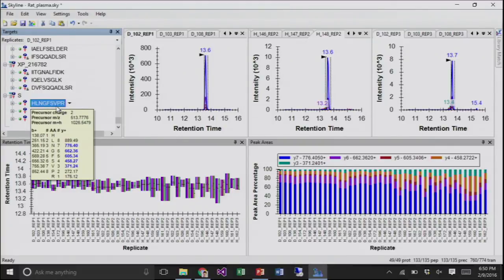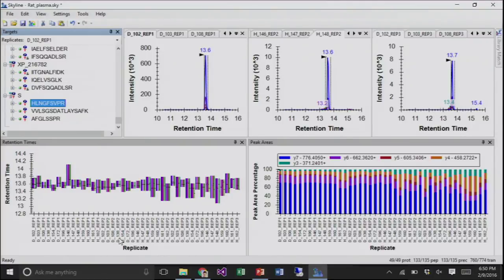Where are the issues? Other than these two. Not allowed to answer. Come on. Where? What? A lack of coelution. How do you know that? I guess I have the wrong panel out. What are you seeing that's telling you there's a lack of coelution? I guess I'm seeing the wrong thing here.